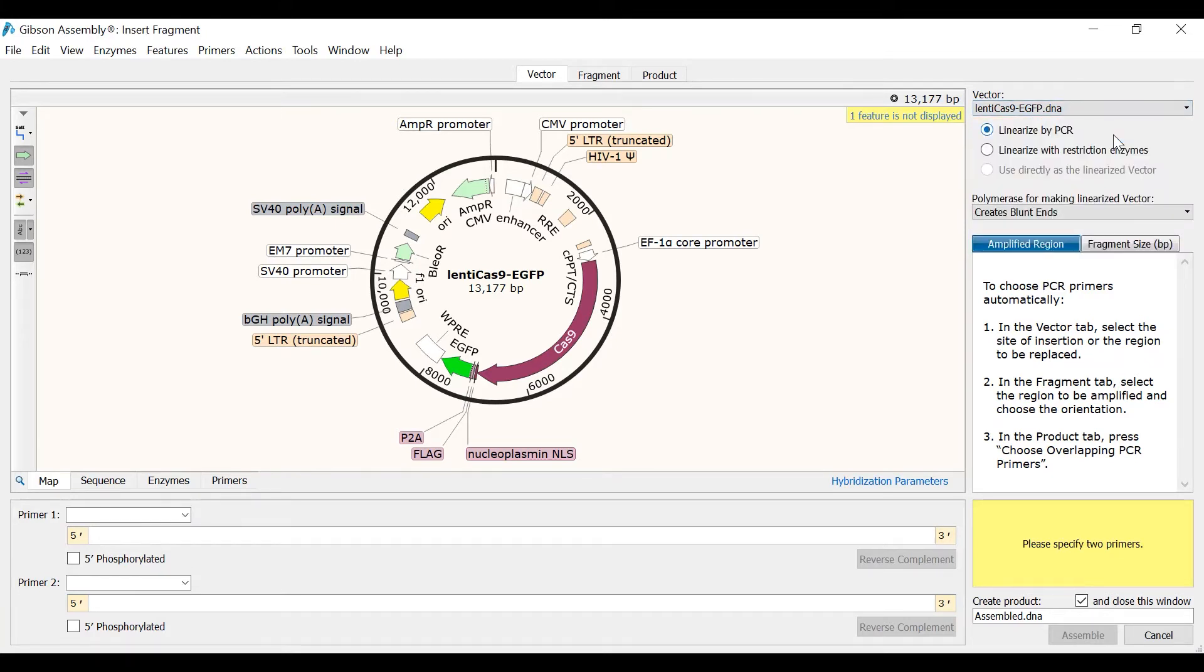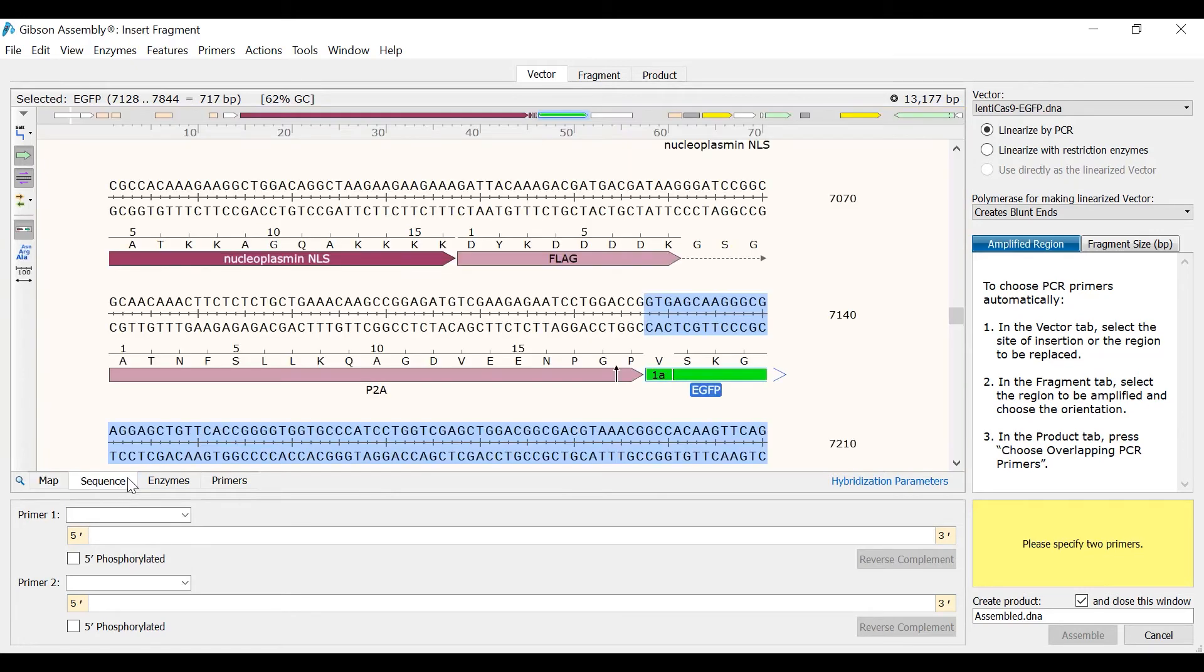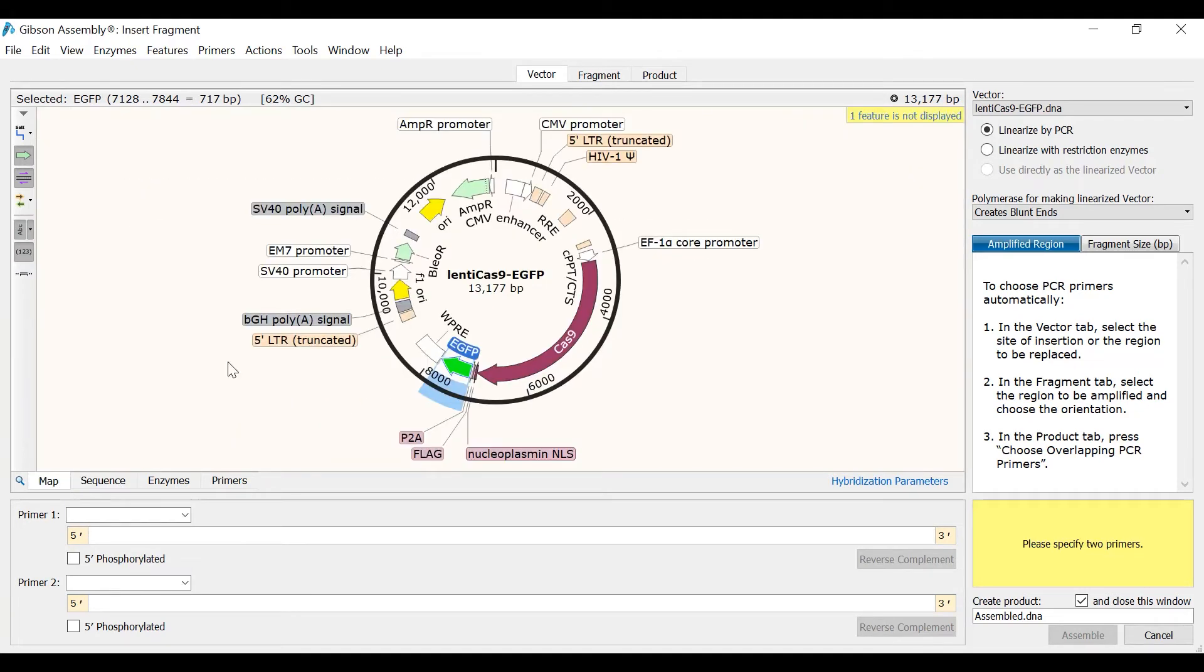Next I will select an area within the vector that will be the site of insertion or will be replaced. In this case I want to replace the EGFP reporter, so I will select this feature. If you need more precision when selecting a region of insertion, you can switch to the sequence view. I will now go to the second tab called Fragment.